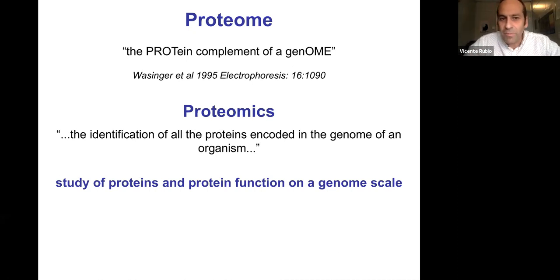So yes, as I said, some terms about proteomics. This is general, not just for plants. The proteome is a complement of a genome, and this is a very simple definition. Actually, what we want to do with proteomics is to study in a high throughput manner the expression and function of all proteins in a genome in a particular organism. This presentation will be available, so you can relax and just go through it easily.